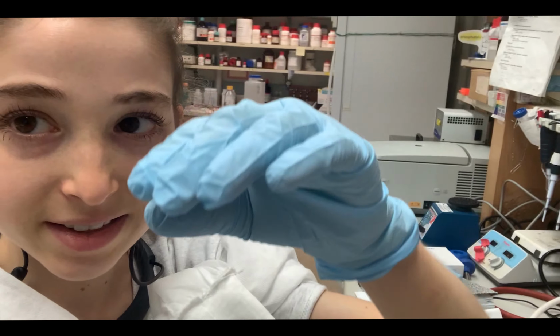It's really handy. So I highly recommend one of these T rulers. But anyway, I cut them out and put them on the top of a styrofoam lid from a cuvette. I steal them when they come in.